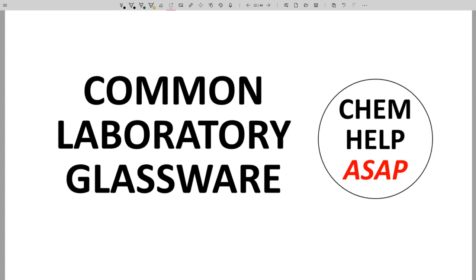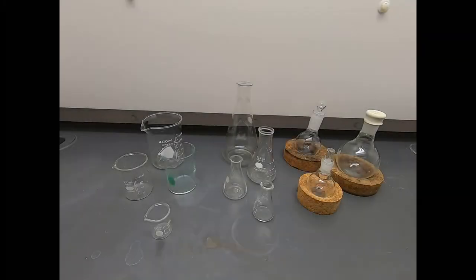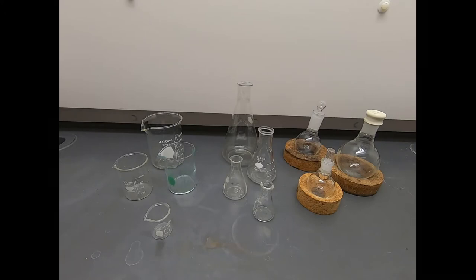Welcome to Chem Help ASAP. In this video, we're going to talk about some common laboratory glassware that students encounter when they take undergraduate organic chemistry laboratory classes. The glassware on the screen right now are examples of what I consider to be the workhorse types of glassware that you encounter in the laboratory.